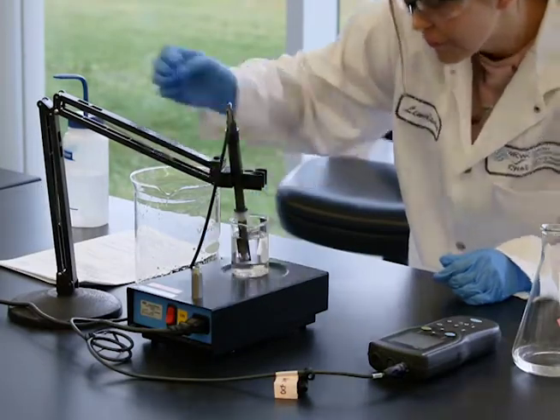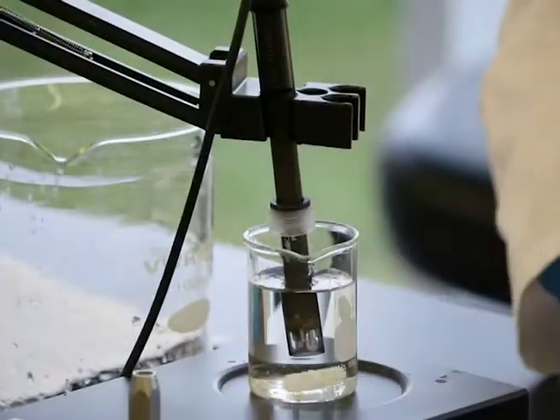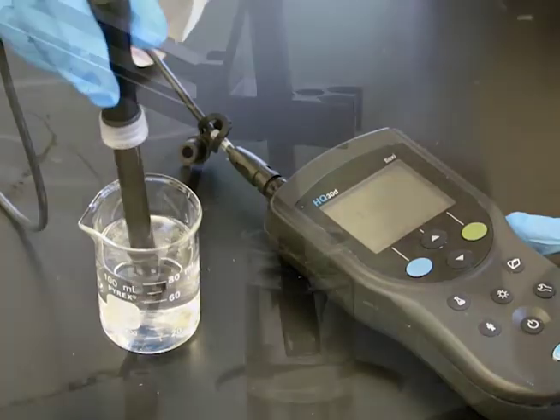Ensure that there are no air bubbles stuck on the probe. Stir the sample at a slow to moderate rate. If you do not have access to a stir plate, you can move the probe up and down in the sample to dislodge air bubbles.